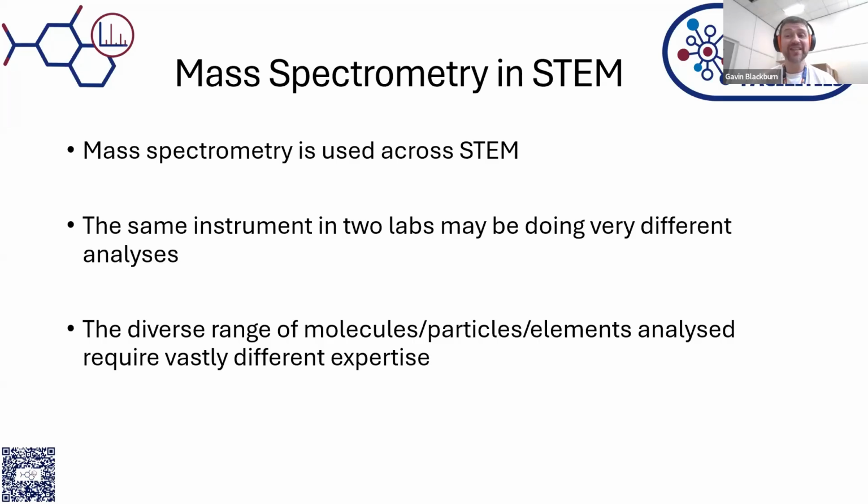You may even find exactly the same instrument in one researcher's lab and another researcher's lab. And you may wonder why we have multiple instruments. And it's because the way you set those instruments up has a real effect on what they can detect and what you are going to use that thing for.